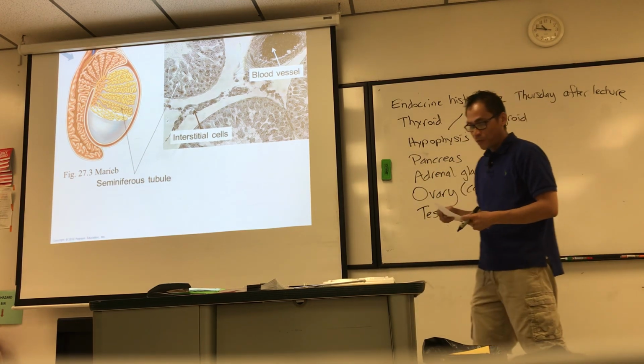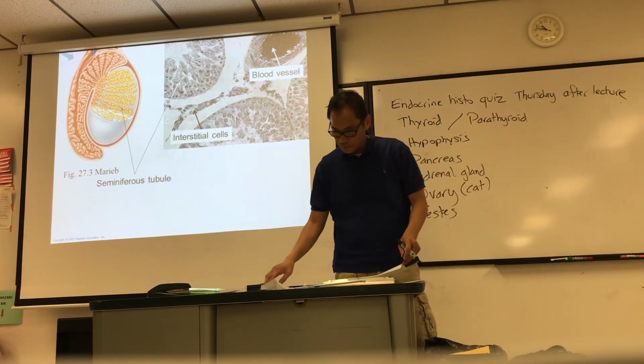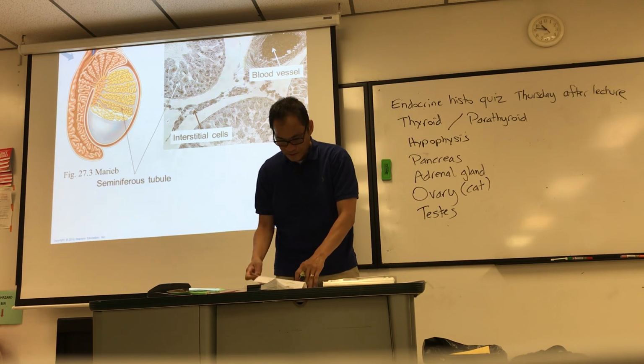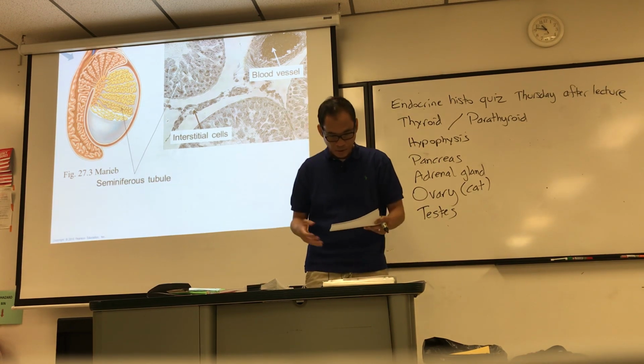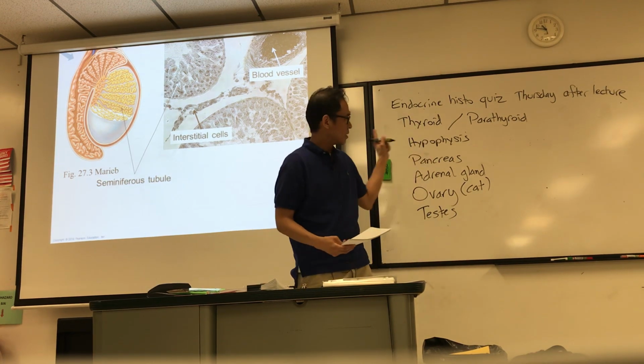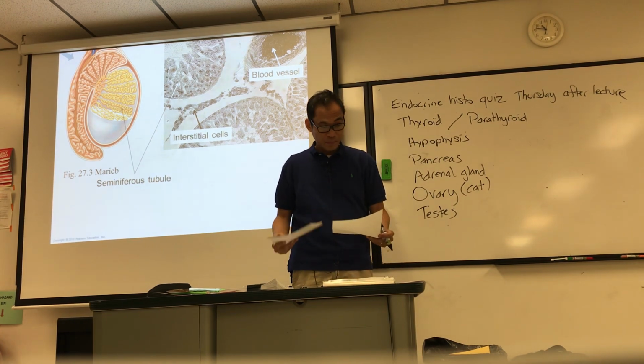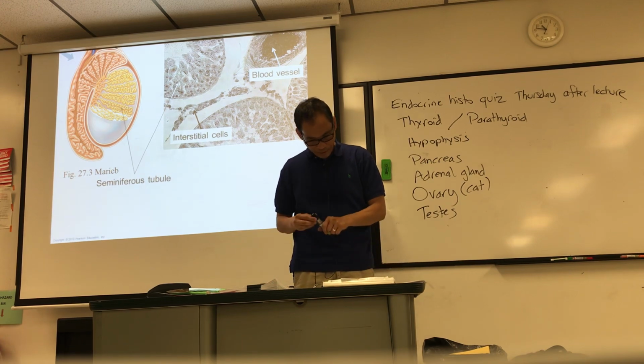Now, one thing I want to encourage you to do is to know where the slides are located if you want to go to Open Lab and study these slides, the same ones I'm going to look at now. It helps to study them on your own with the microscope in front of you. So I'm going to write the slide locations down.